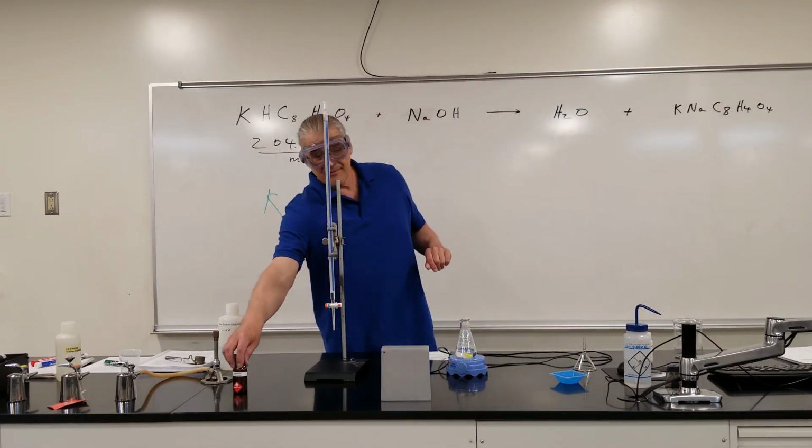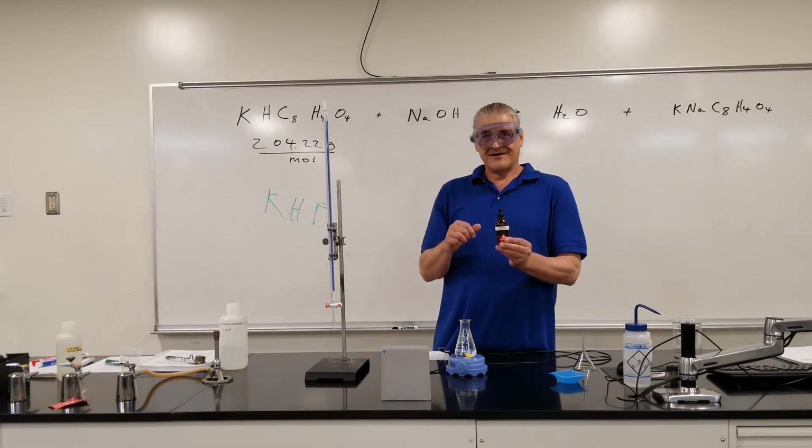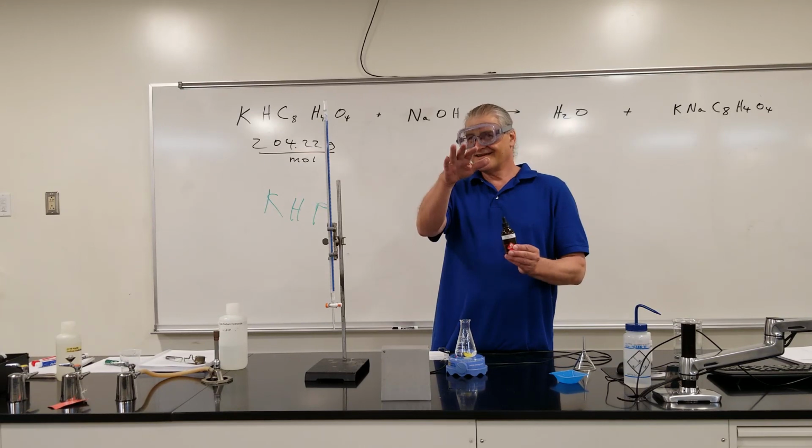It's going to turn pink because we're adding a couple drops of an indicator called phenolphthalein. Again, the spelling will be on the test. Just kidding. Just kidding.